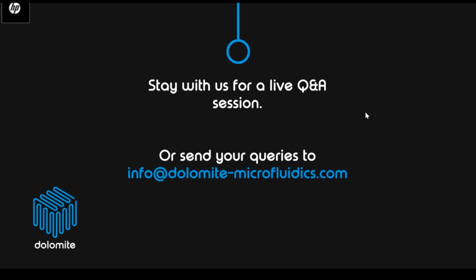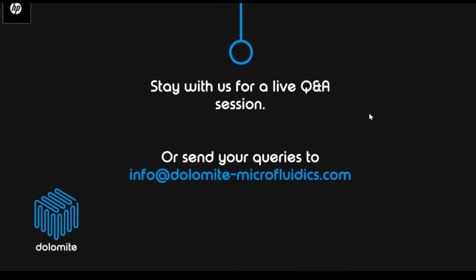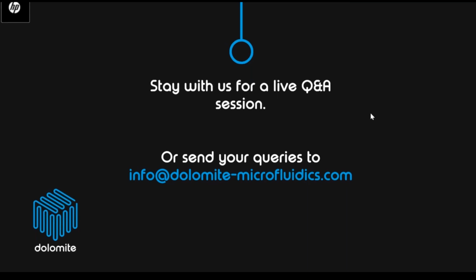How do I choose from 3 chips which one to use for my LNP? That's a very good question, and that's definitely something we can have a whole different session about. Essentially, the way we mix 2 fluids together can influence the final size of your lipid nanoparticle. Usually what we found is from flow focusing to turbulent mixing, there's an increase in the final lipid nanoparticle size, essentially. So it enables you to push the boundary in terms of how large you can make your lipid nanoparticles.